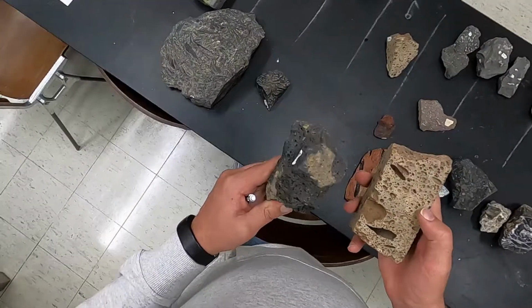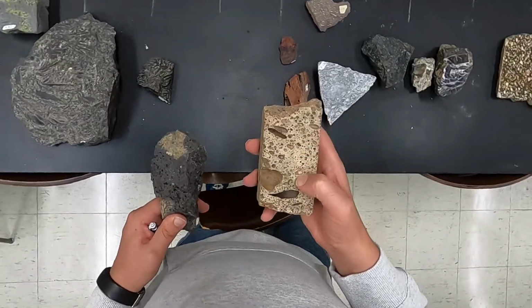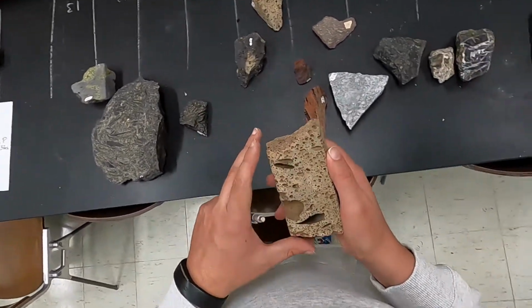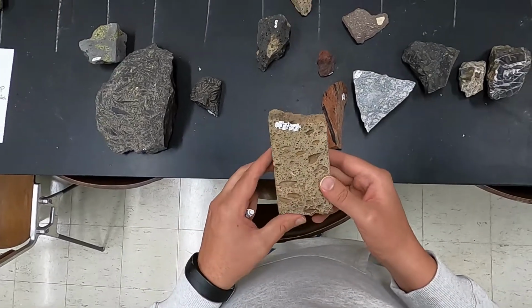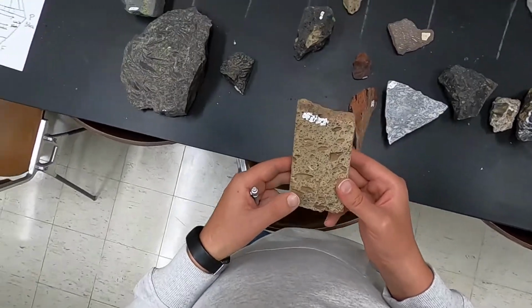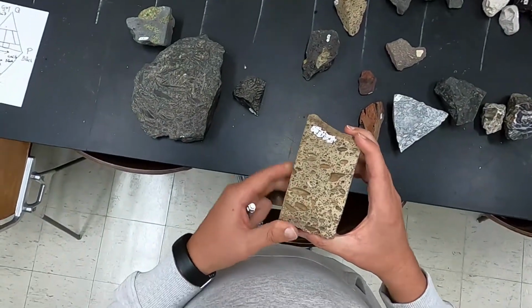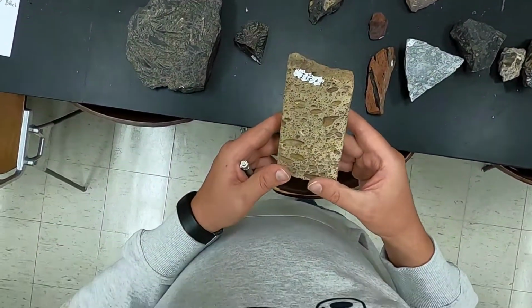So that's quite interesting. It's interesting also to find that these bubbles or vesicles have an elongation in them. So when they are elongated like this, it's indicative of compaction, and so it's easier to interpret it as a thicker pile of lava that was at the phase of degassing, and then some of these bubbles have been compacted and led to this characteristic texture.